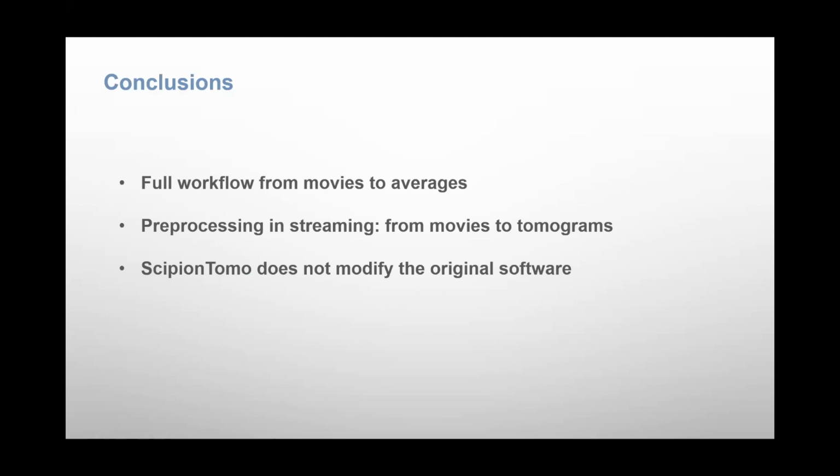It's true that if you want to extract as much information as possible, you have to curate manually the data sets. But despite that, you will have some feedback about your acquisition with this live image processing tool.